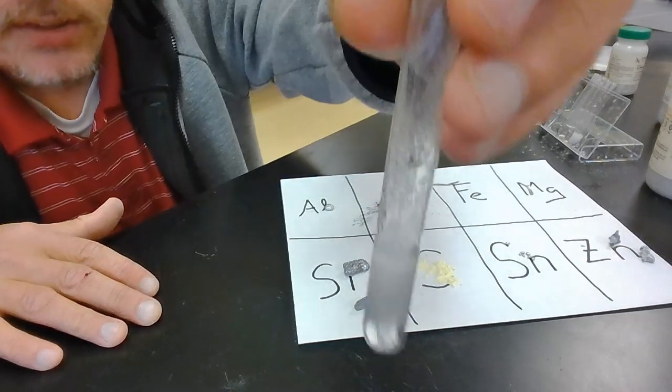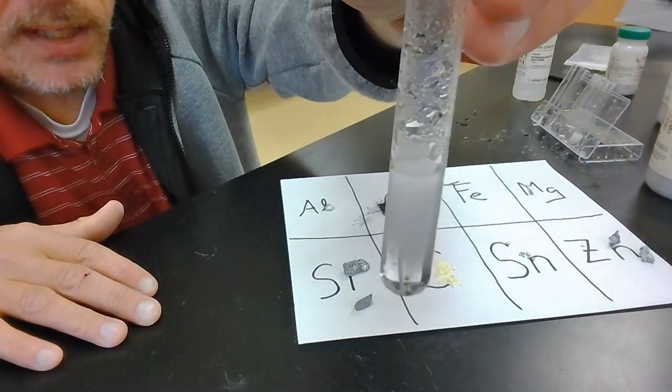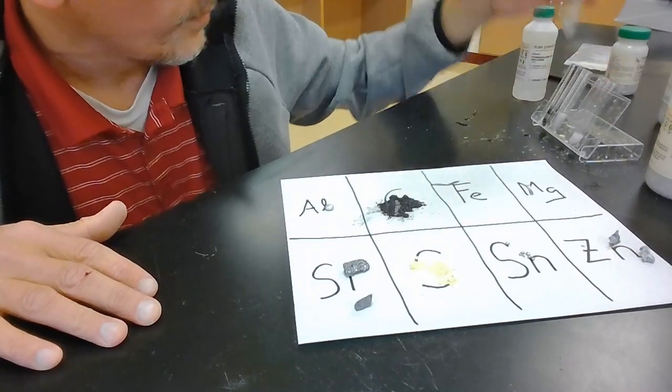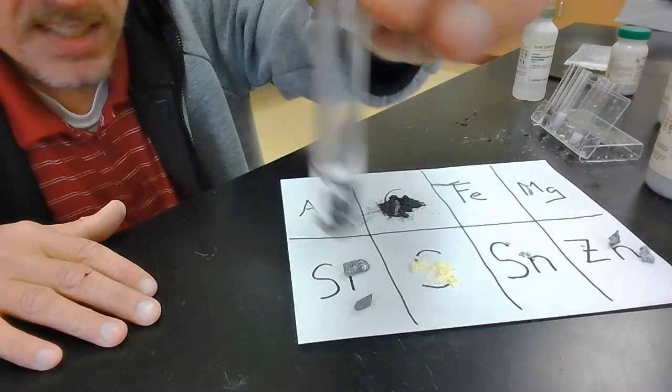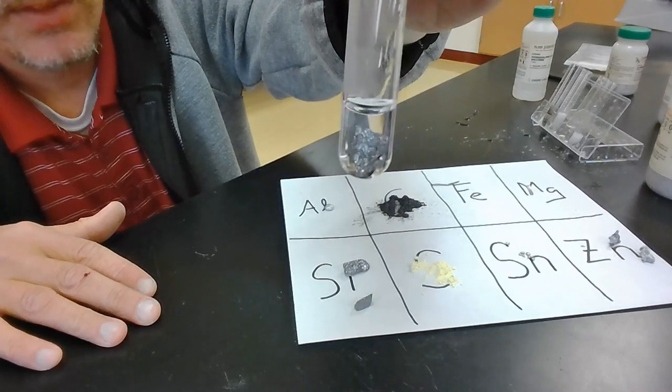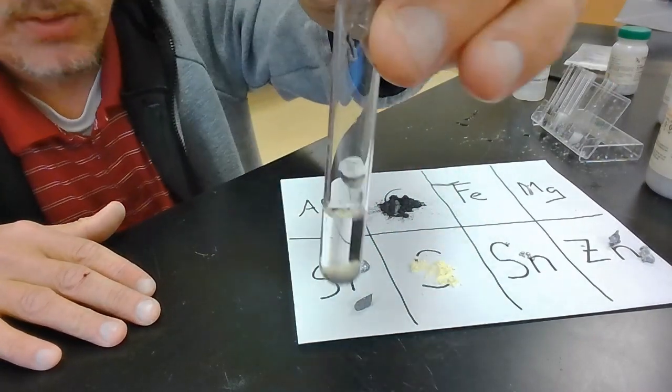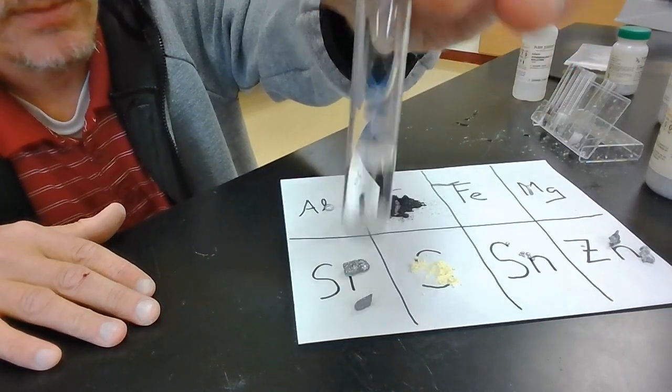Magnesium definitely had a reaction. We still have a reaction going on. It's still continuing. Silicon, there's nothing happening with the silicon. There's no reaction. Same with the sulfur. There's nothing happening with the sulfur. Nothing going on.